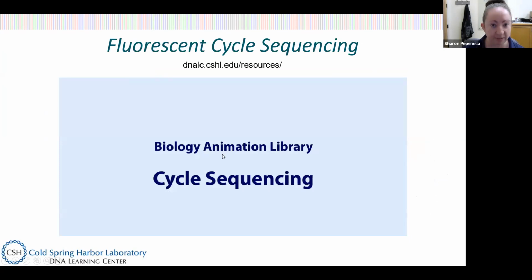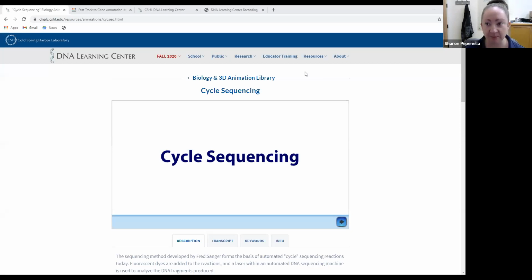So I want to just demonstrate to you how this works. I'm going to share with you an animation that we have developed. Okay, can everyone see my animation here? Okay, great.